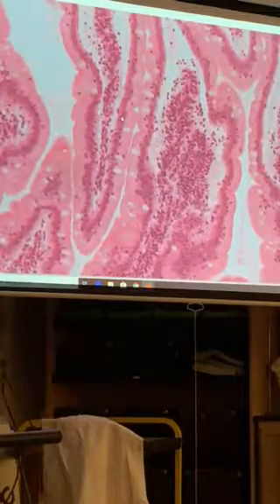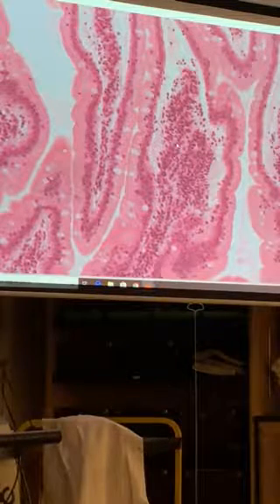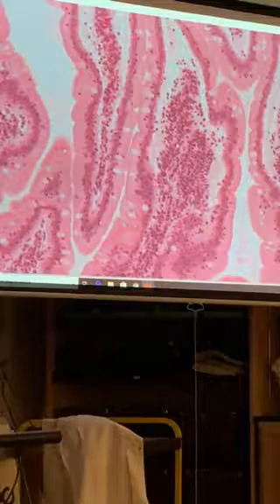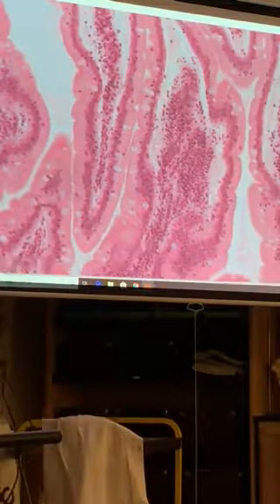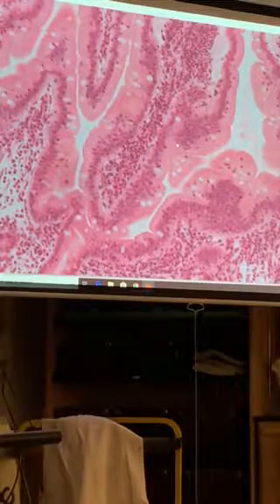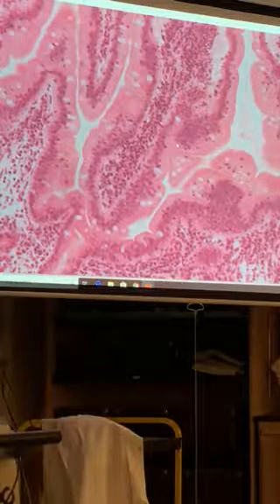All right, back up to these guys. What kind of tissue? Here. Here. In here. There. Could also go down a little. In here. Here. Okay, what kind of tissue is that?